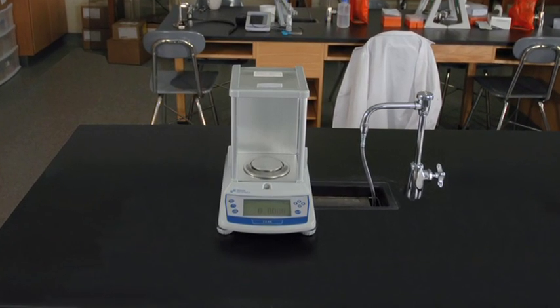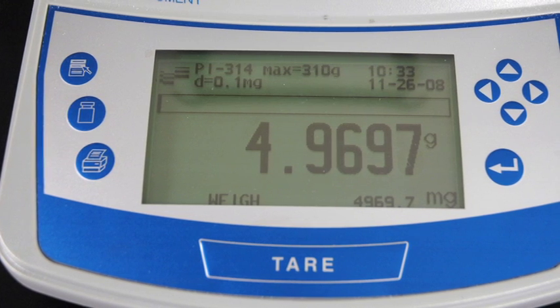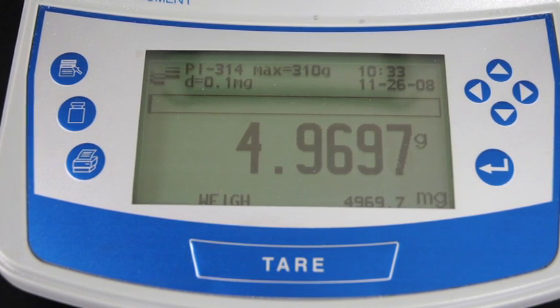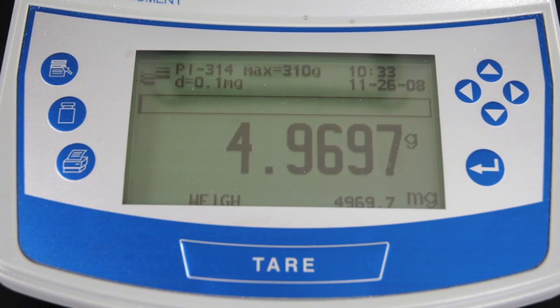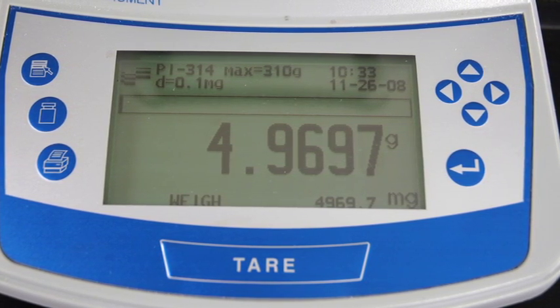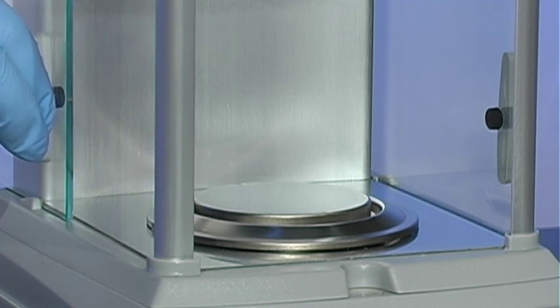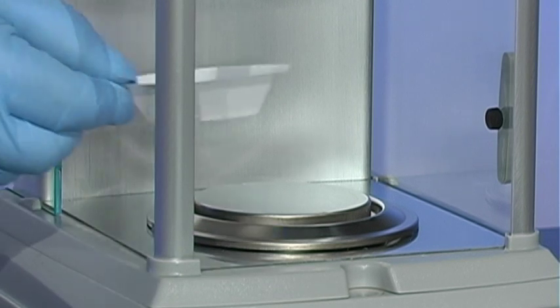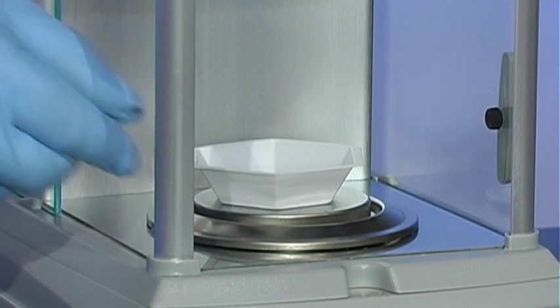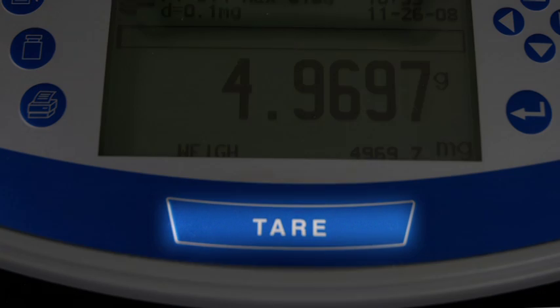The most commonly used balance in biotech laboratories is called an analytical balance. An analytical balance allows us to take very precise measurements up to four places to the right of the decimal point. Sliding glass doors prevent air currents from affecting the measurements. The tare button zeroes out the balance.